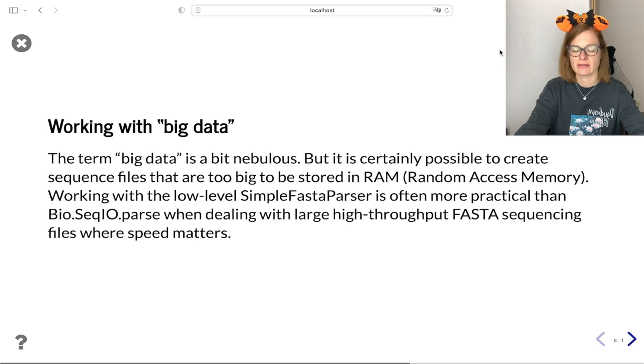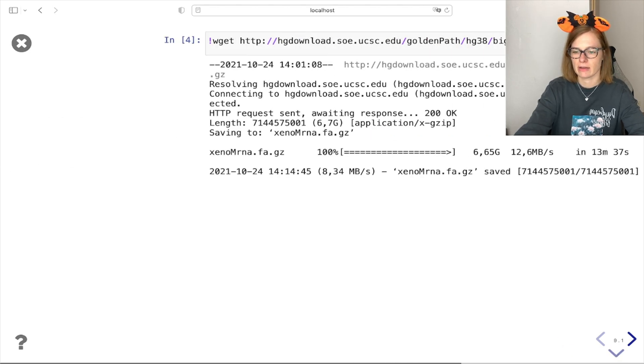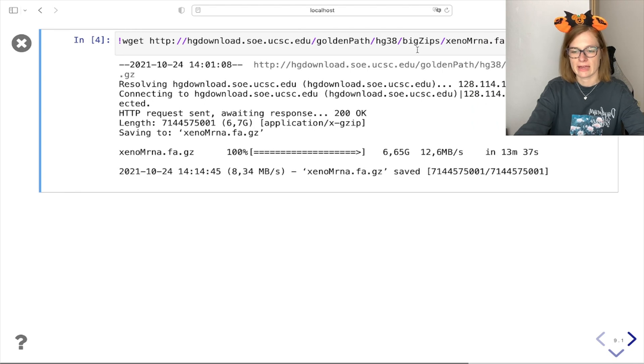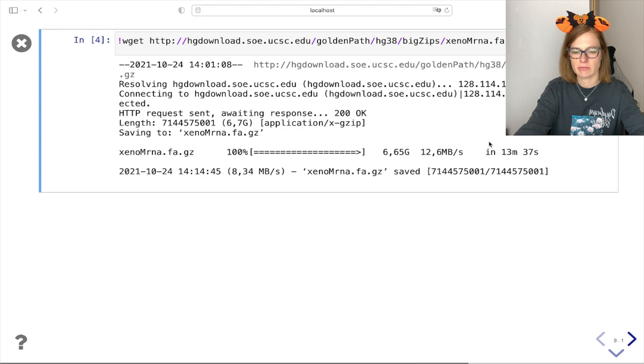We are going to showcase exactly that, but first we need to make sure that we have a big enough file. Again we use the following command to download the file. This will take approximately 13 minutes.